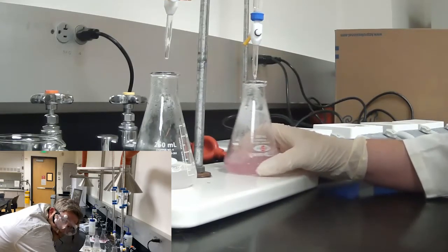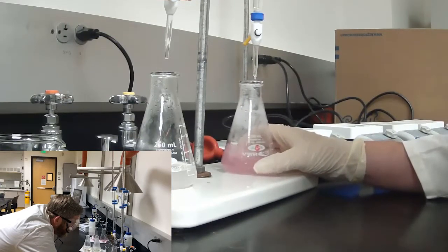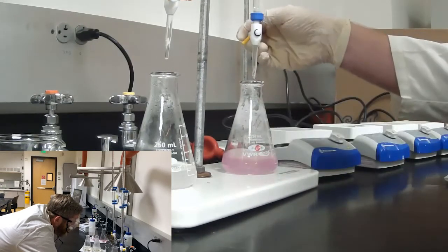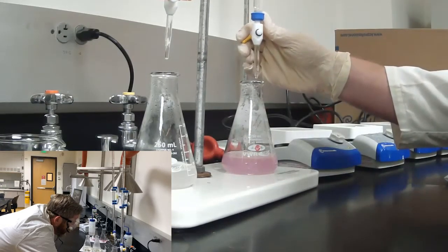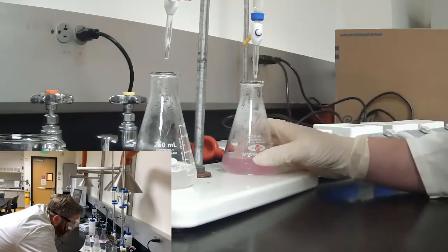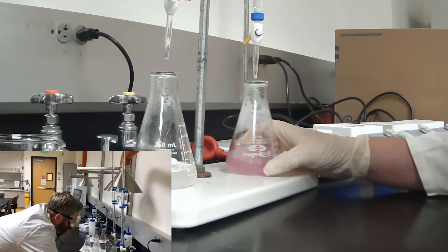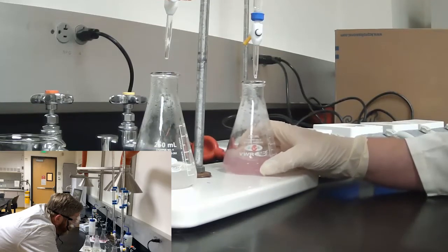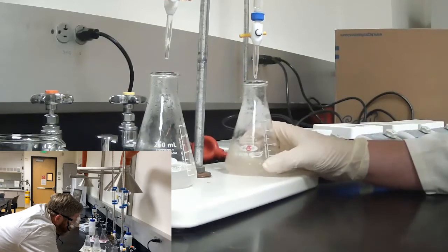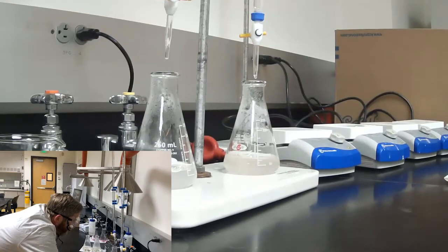This is the one that takes 40. Yeah, because usually the neutralizing capacity is only about like 10%. I know it's not as good as sodium bicarbonate, but it's all I can remember for sure. Plus, it sort of depends on what mass you started with, and I started with lower masses so that this would take as short of a time as possible. I learned that from my TA in Gen Chem 2, which I took as a senior, because I tested out of the lecture.